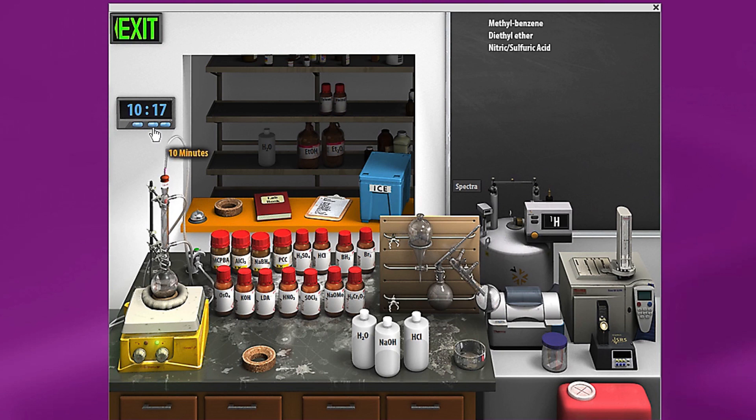I'm going to advance the time a little bit. You can see I advanced to 10 minutes when we begin to form some of our products. In this reaction specifically, you're getting a different substitution on the benzene ring of the nitro group. For the 2-nitro, you can see here it substitutes the nitro at the ortho position. And you also get the 4-nitro substitution at the para position.